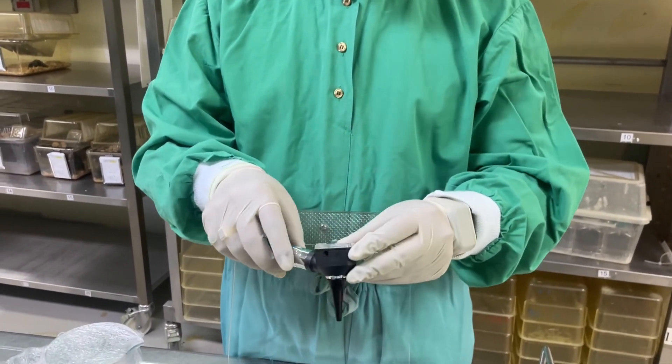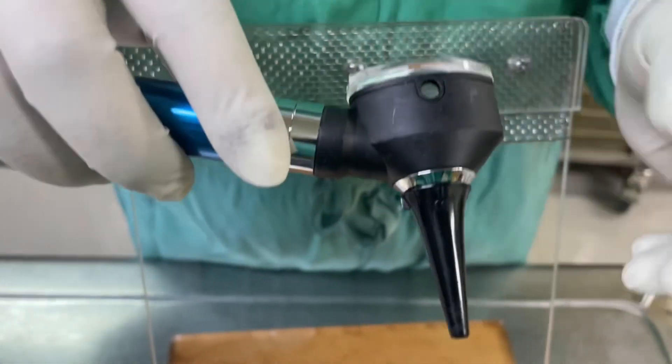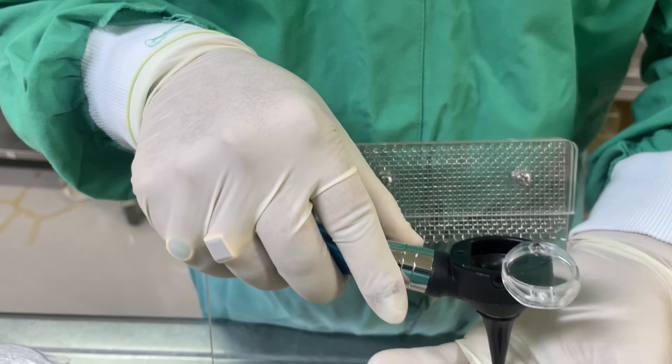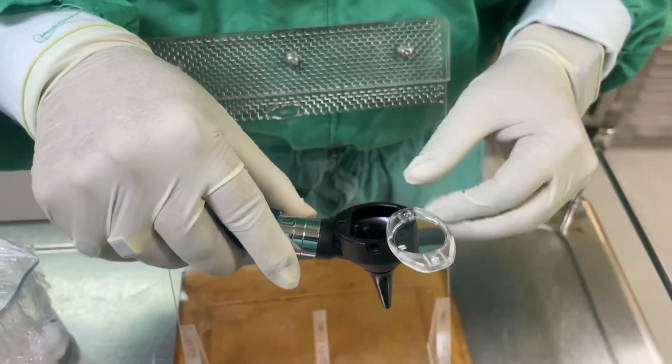This device is called an otoscope. In order to perform the intratracheal procedure, we first need to insert this into the mouth, then open the cover and turn on the light. You can see the light here — and in this light you can see the trachea of the mouse.